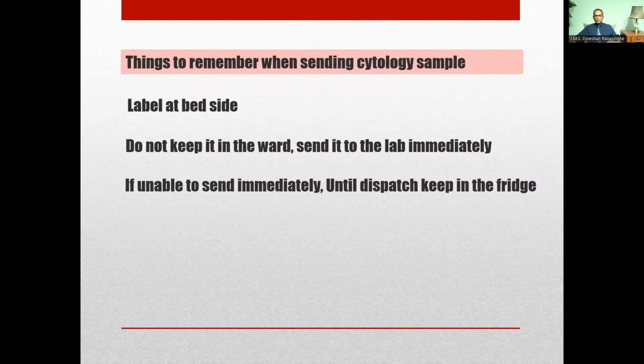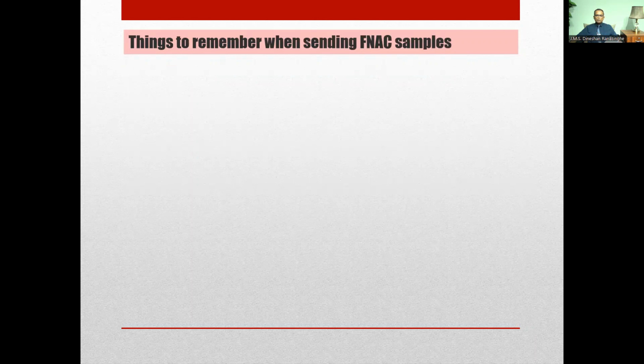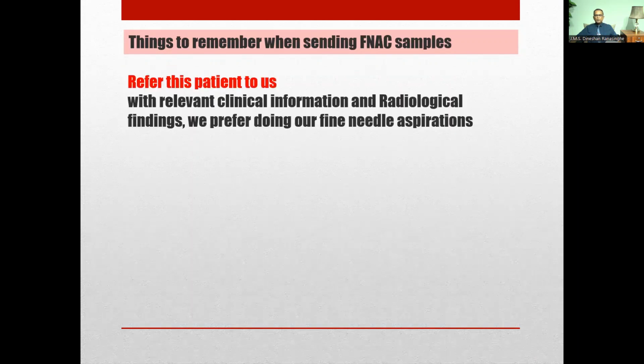And if unable to send immediately until you dispatch it, keep it in the fridge. And especially if you are doing FNAC samples, you have to remember, refer the patient to us. We would like to do the FNACs by ourselves. And there's enough research done on this.